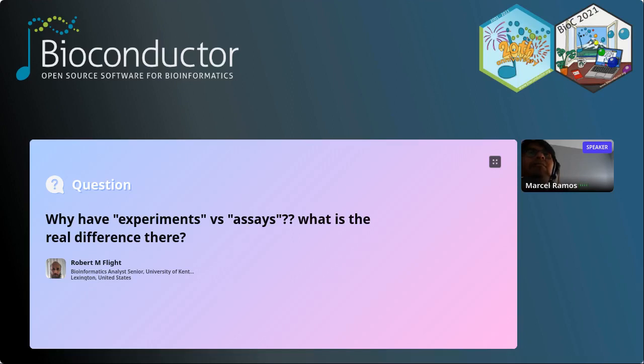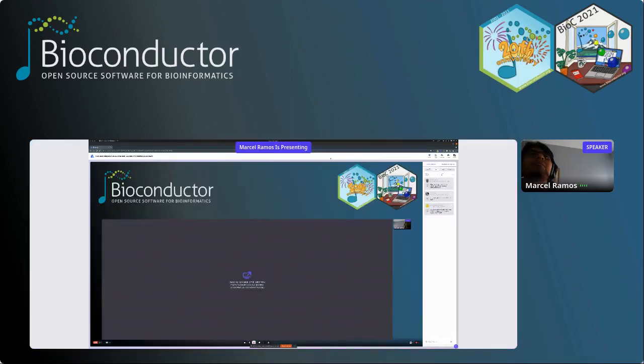And assays will reduce all of your data to matrix format. So multi-assay experiment supports several classes that have a rectangular shape. So you can include single cell experiments, summarized experiments, or ragged experiments within a multi-assay experiment. When you run that experiments function, you'll get those classes back. But when you use assays plural, you'll get more of a reduced format as a list of matrices.